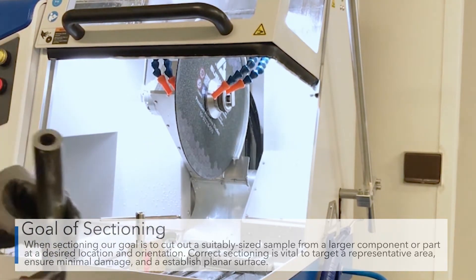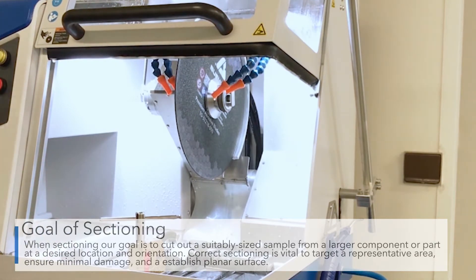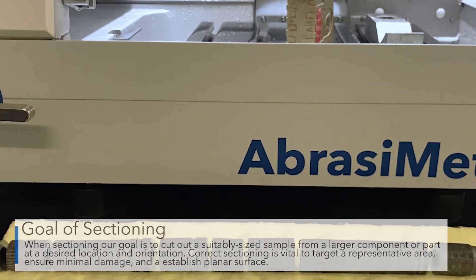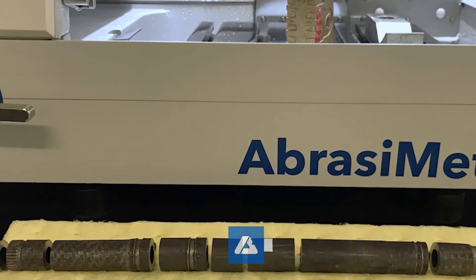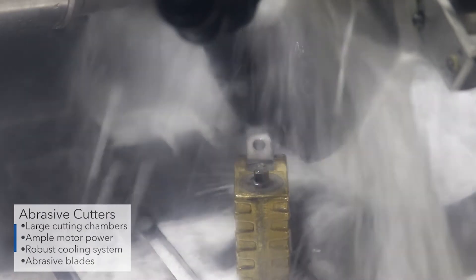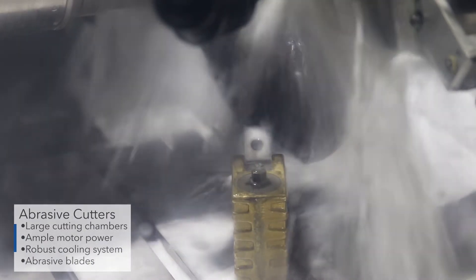These cutters are designed to help users minimize mechanical and thermal damage. Proper sectioning also helps minimize time spent during grinding and polishing. The most commonly used sectioning device in a metallographic laboratory is the abrasive cutter.